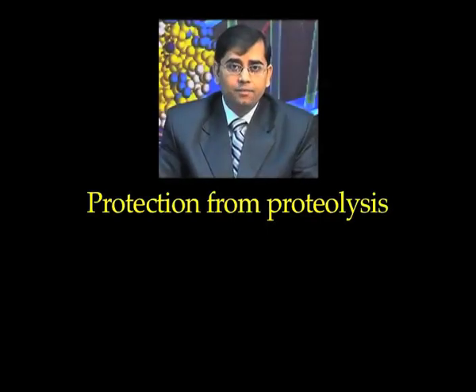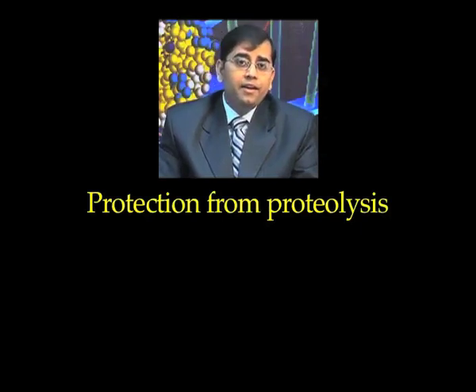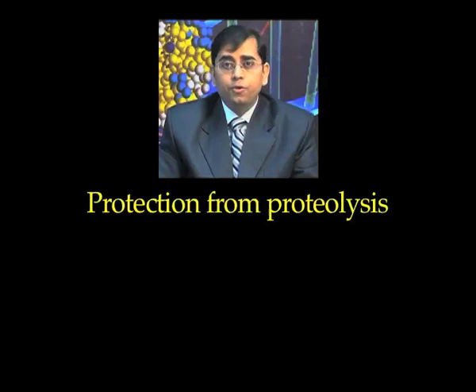Now, you have tried to break open your cells and release all the protein components and other cellular components present inside the cell. But often during this process of grinding and lysis, you may degrade some of the proteins, and you need to ensure that you protect your protein from the proteolytic activities of various enzymes.